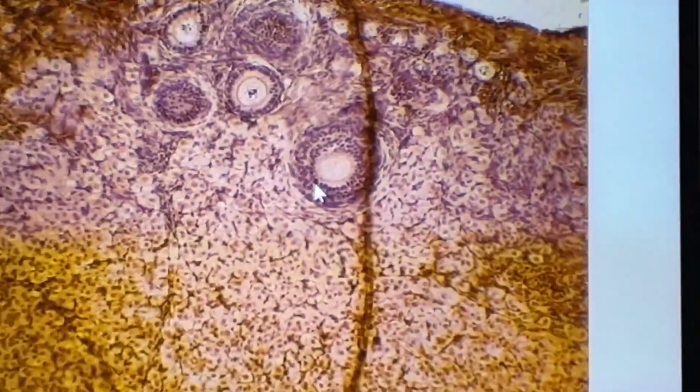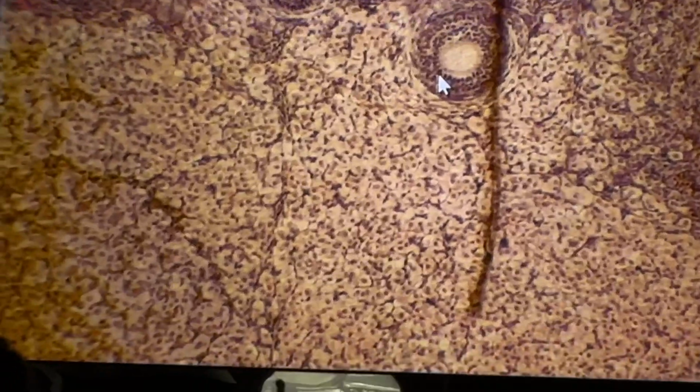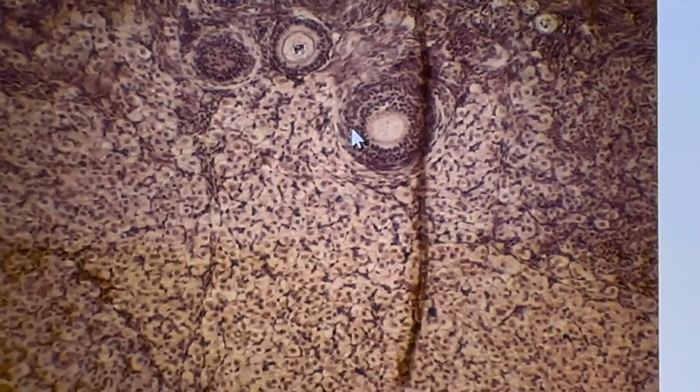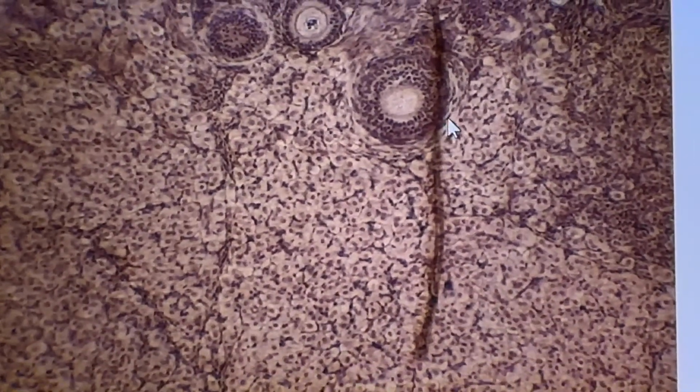After that, with the evolution, the theca interna and the granulosa form the corpus luteum. You can see this is the inner layer, I will point it out here. This is the theca interna and the connective tissue or fibrous tissue. This is the theca externa.